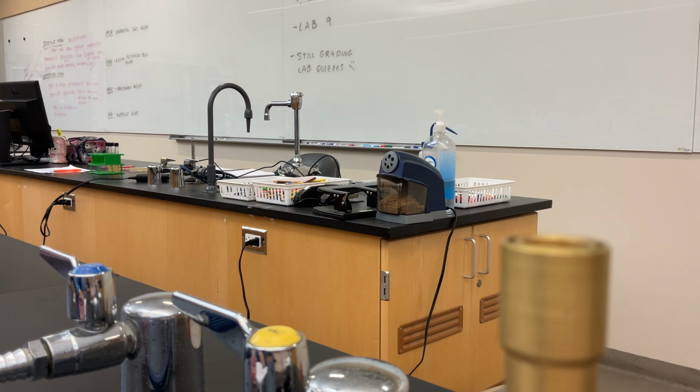So this will even help me make sure that I have the right gram stain results. I can wait a day to get these growing, and then I can do the gram stain from these plates that I'm setting up when I've isolated out a lot of the background noise. See the beauty of that? Kind of goes hand in hand, right?